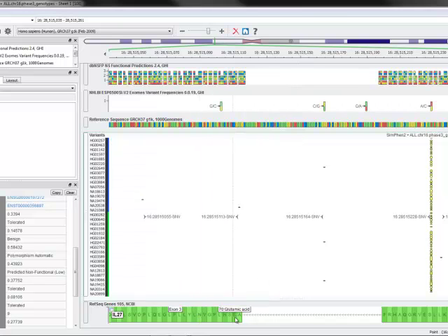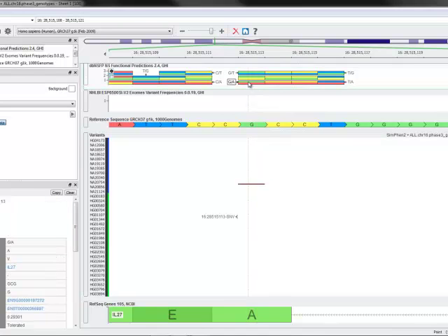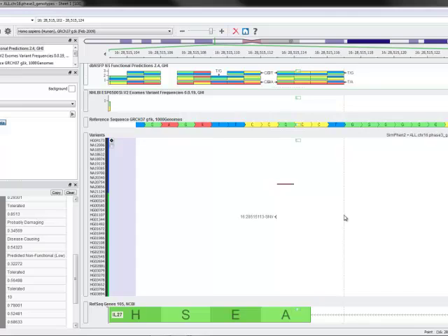So just over here in the next exon, let's take a look at this one. Here we see a variant that appears to be very rare. It's not captured in the ESP database. And if we look at the functional predictions, a G to A change at that location, which is what our variant is, a G to A, we can see, again, it is non-synonymous. We see what the amino acid change is. This one, though, is predicted as potentially disease-causing or probably damaging by a couple of the methods. They don't all agree, and that's not unusual, but it gives us something to go on.